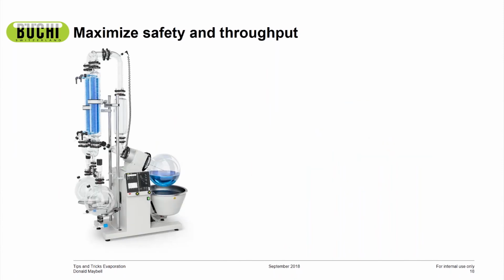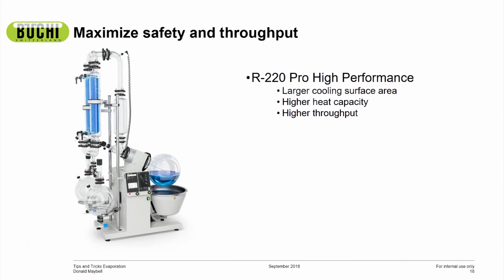And then, another hint, we have the exact same thing for the industrial unit. If you are doing big batch solvent recycling, or working with solvents on this large of a scale, the same thing still applies. All the stuff that I talked about before scales up to the industrial units, no problem. All the parameters are still the same.